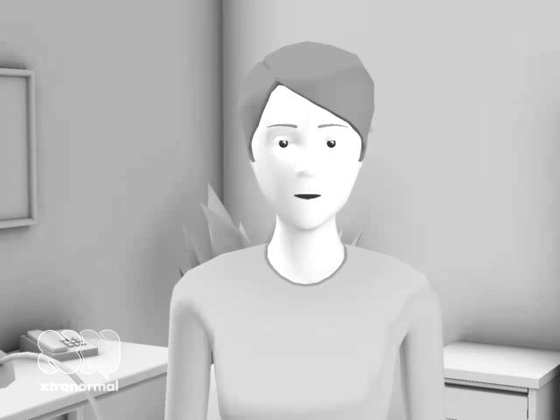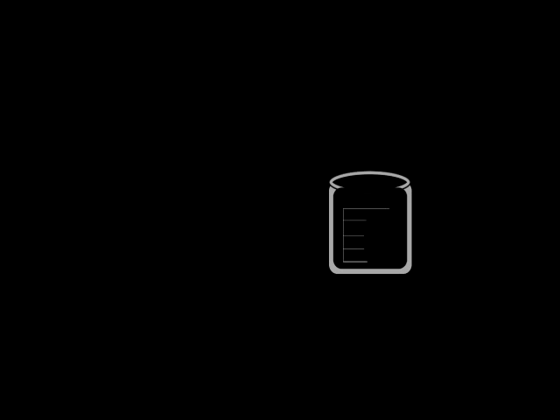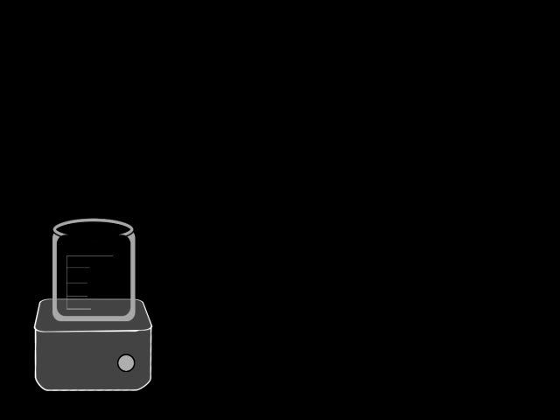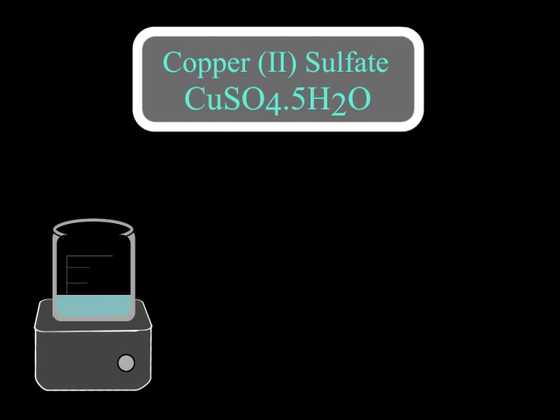Today I will be showing you the synthesis of copper carbonate from copper sulfate in this segment. First of all, we take our 500 milliliter beaker and place it on our stir plate. We add 200 milliliters of the distilled water to the beaker, add the sample of copper sulfate, and dissolve it into solution.